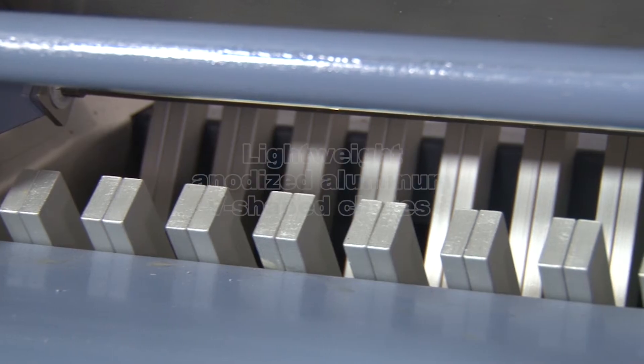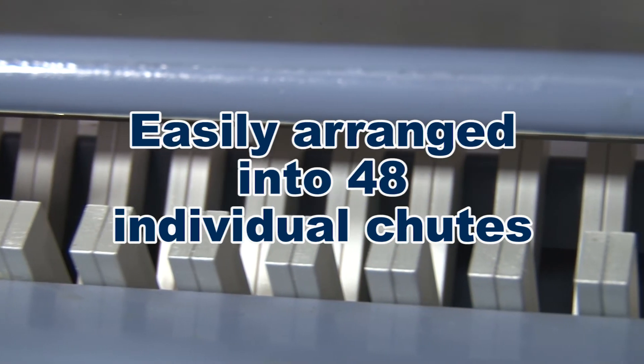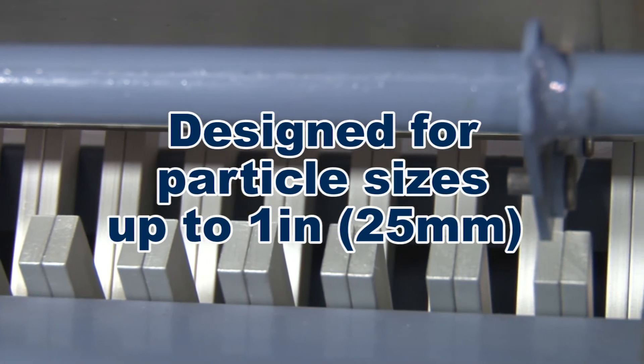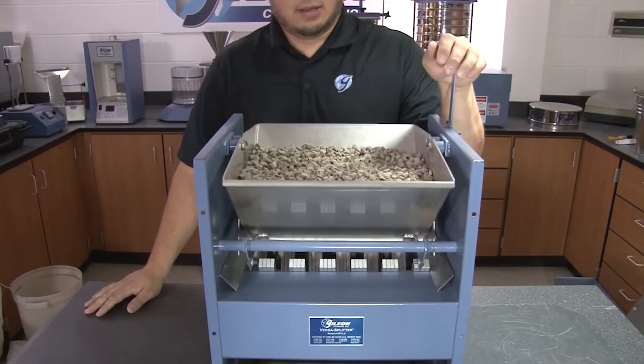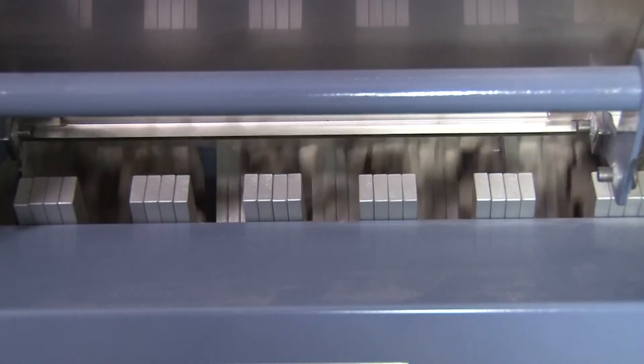The adjustable lightweight anodized V-shaped chutes can be easily arranged into 48 individual chutes and are designed for particle sizes up to 1 inch, allowing for total user control and ensuring the most accurate splits possible.